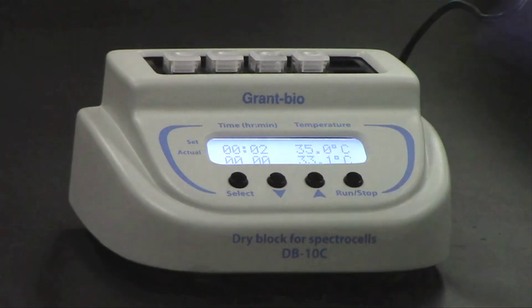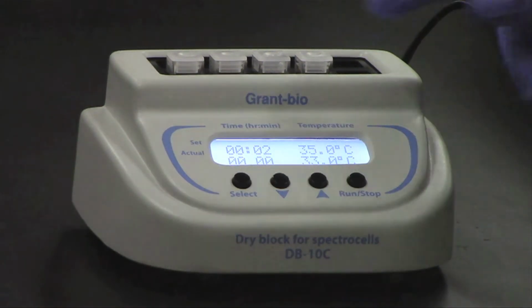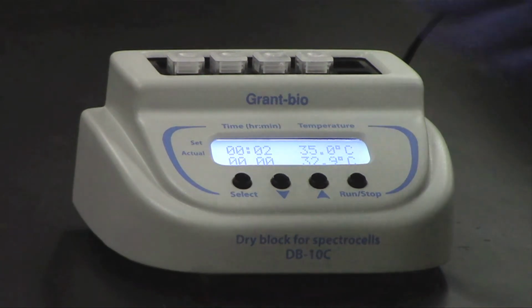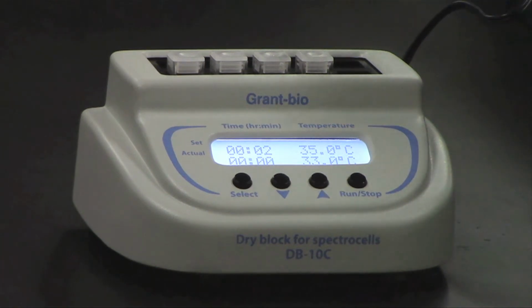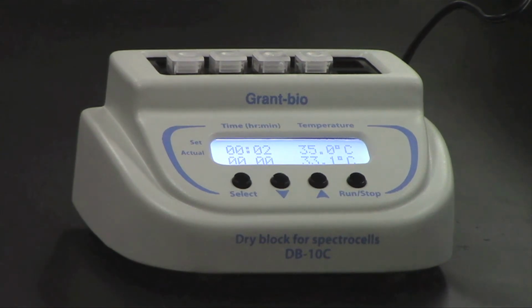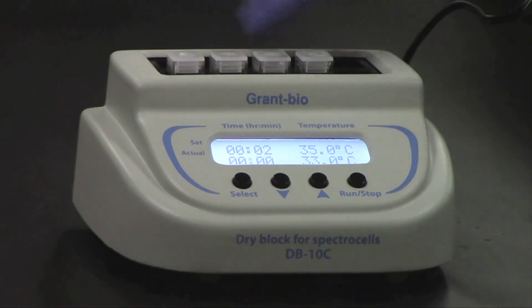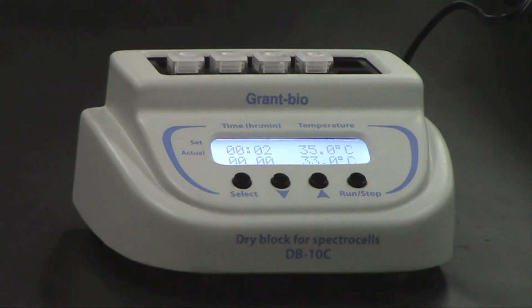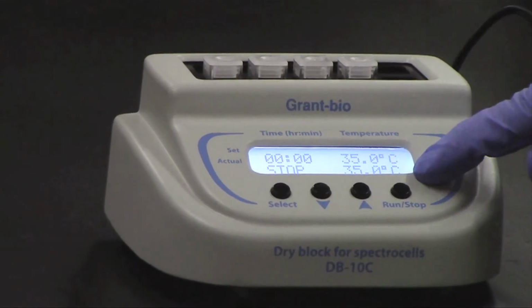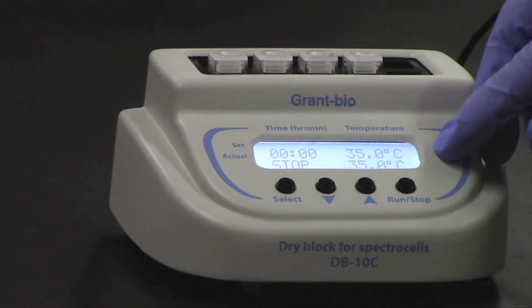But what you'll notice eventually is that the 0 will turn to a 1, and then eventually to a 2, and then when the 2 minutes is over, it'll beep. And this is mostly useful for if you want to allow the cuvettes to equilibrate at a new temperature for a certain amount of time. Usually no more than 2 minutes would be necessary for this. And then at that point, all these holders are going to be at this constant temperature, and you'll be ready to do measurements in the fluorimeter.